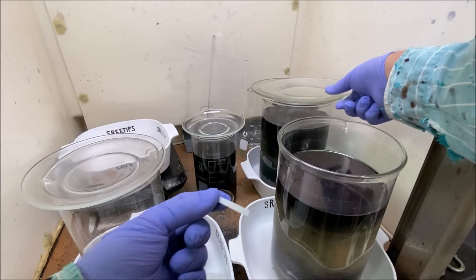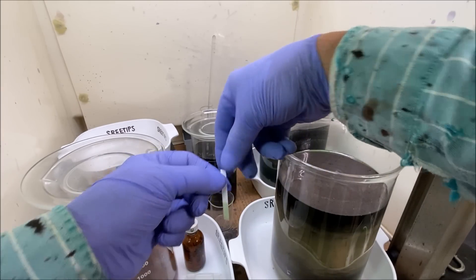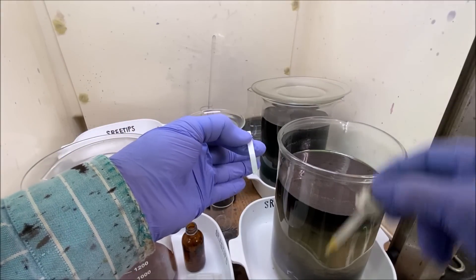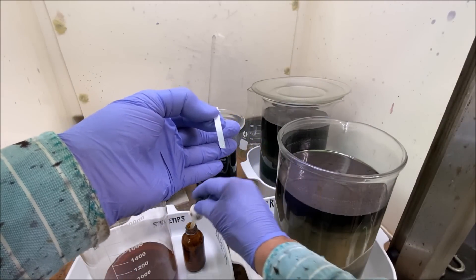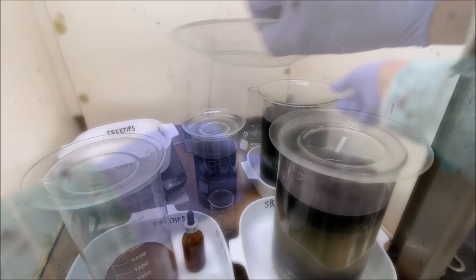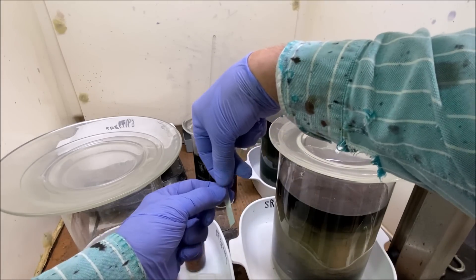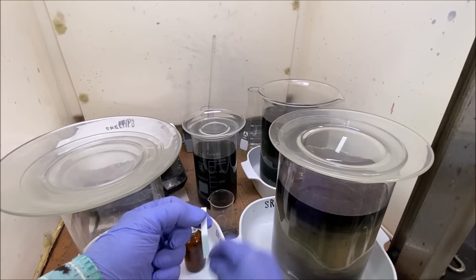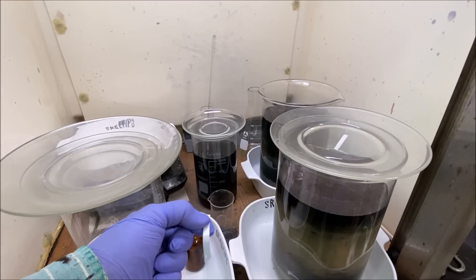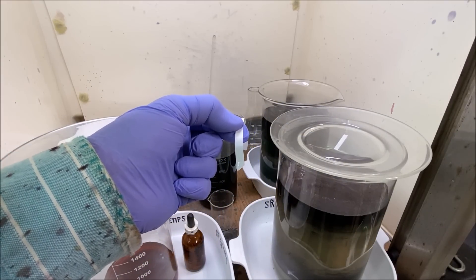We've got these two solutions here. I'm going to test with a little bit of stannous chloride to make sure we don't have any precious metals in solution. I don't see anything in this jar or this jar back here — make sure we've got all the precious metals out of these solutions. I don't see anything in there either.